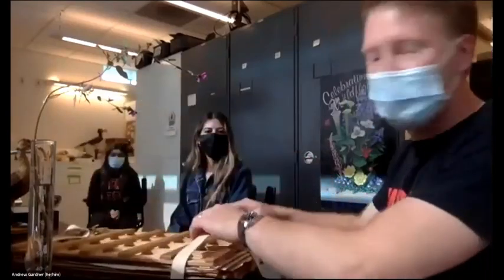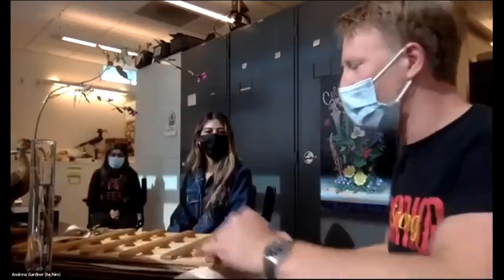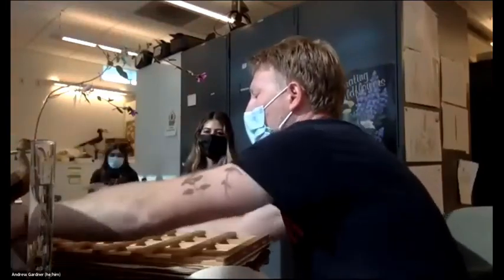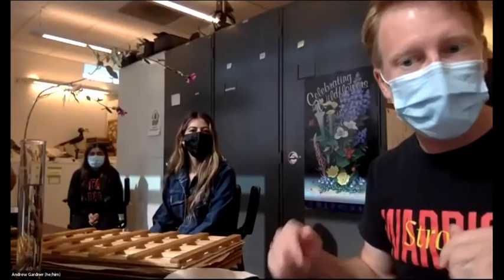This plant press has some straps that hold it together. We'll open those up. So if you want to make a plant specimen of your own sometime and press it, there are a couple of things to keep in mind when you're collecting plants.